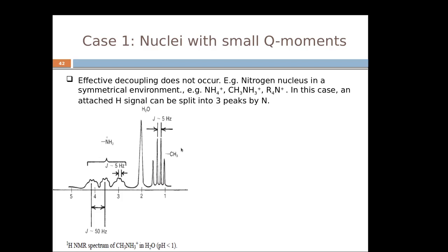This obviously happens because the three CH3 protons couple with the 3 protons of NH3. According to the n+1 rule, the 3 protons split the NMR peak of the CH3 protons into 3 plus 1, a quadruplet.